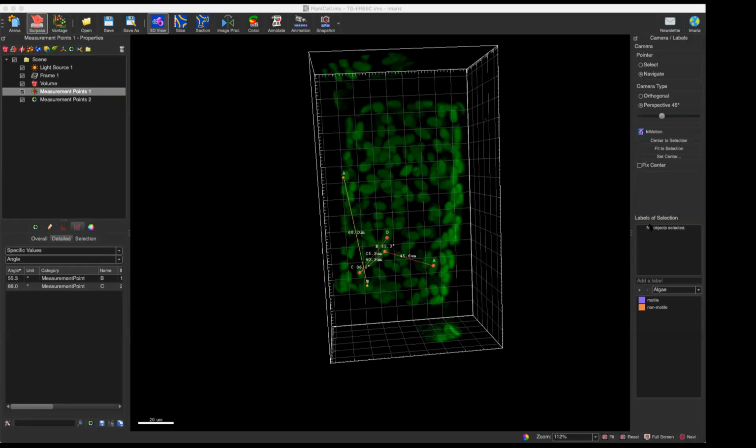Okay, so I will show you in Imaris. Here is just a summary of the Spots statistics, including the number, count, position, and distance between individual spots, or between a spot and other objects like surfaces, and diameter, intensity, etc.